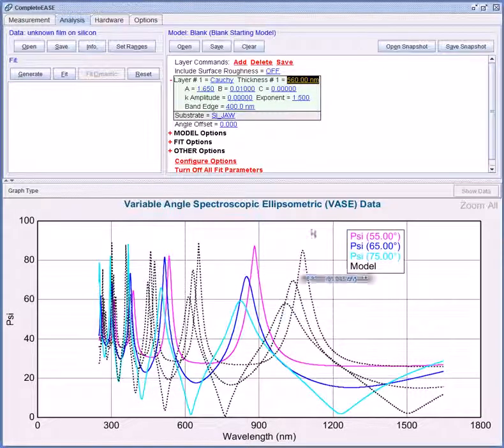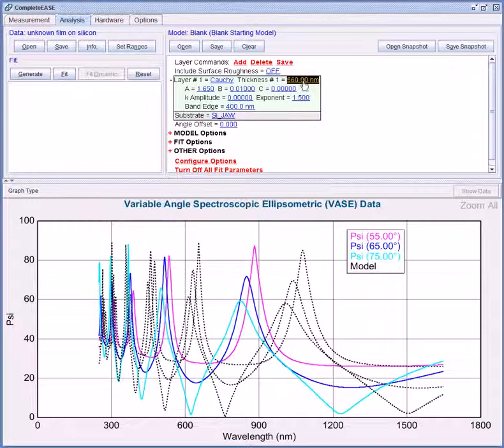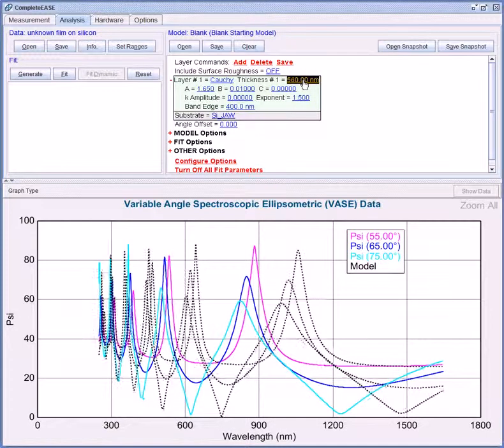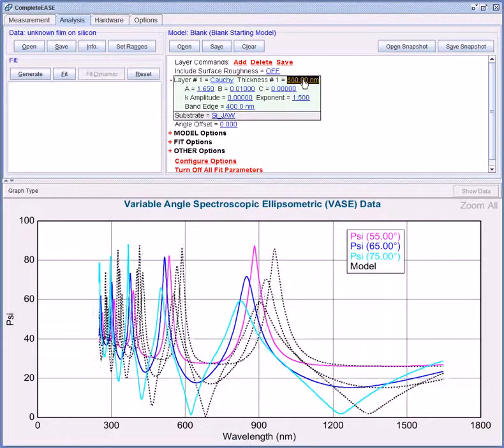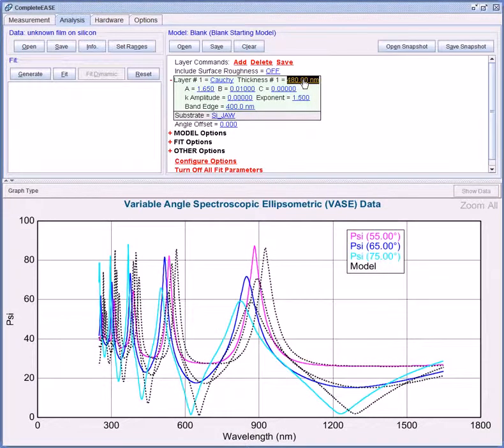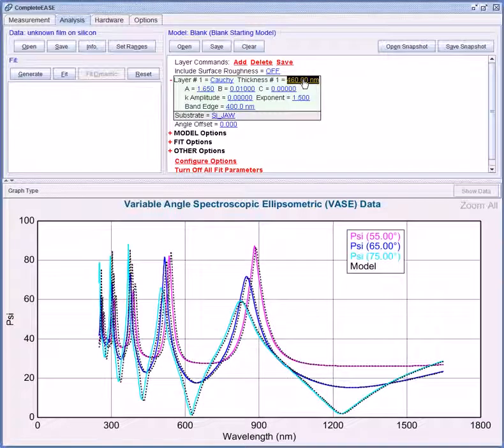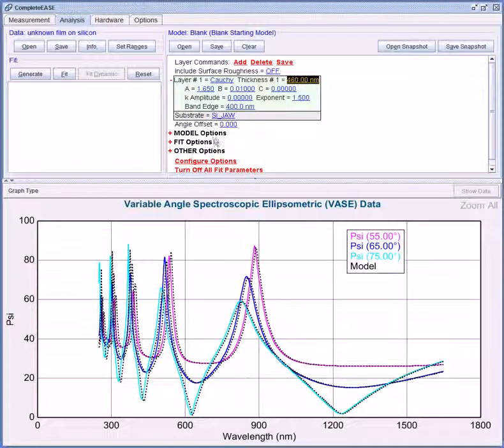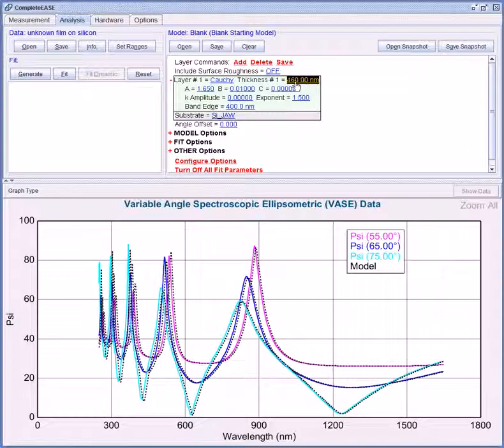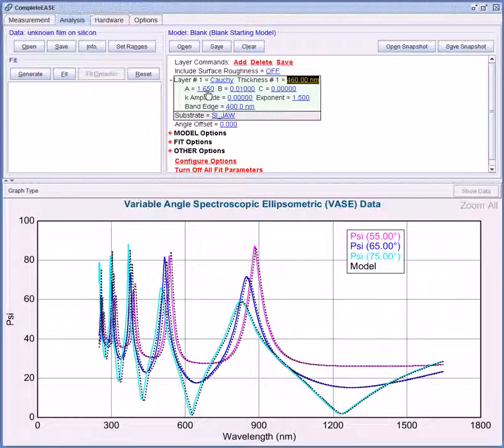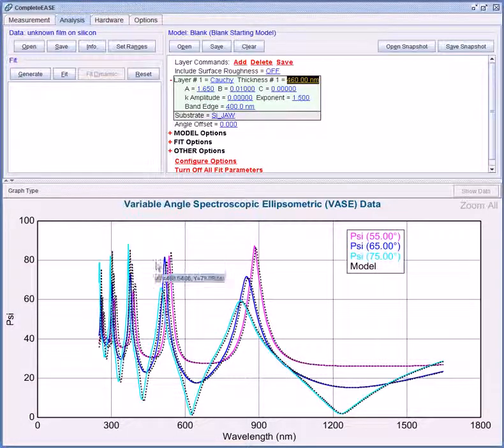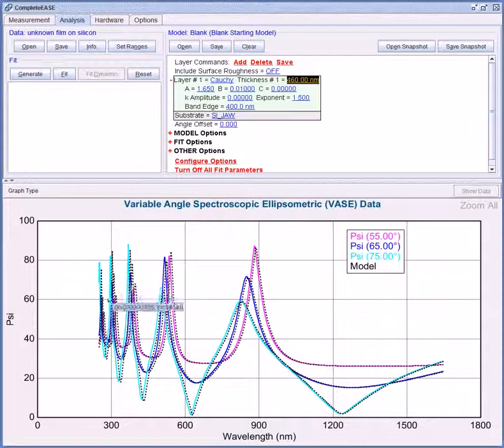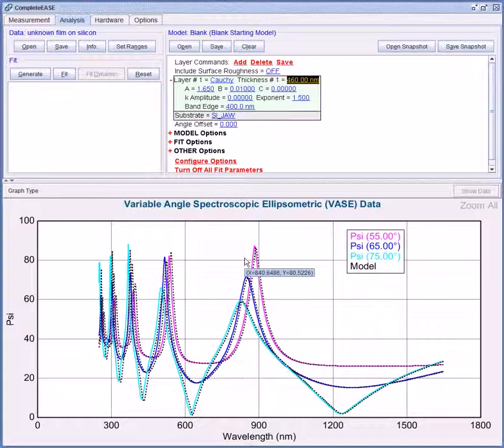And I'm going to go ahead and adjust my thickness again to compensate. So now with a thickness of around 460 nm and index around 1.65, again that's the Cauchy A parameter approximately, you can see that the data are a very close match both in height and in number of oscillations.